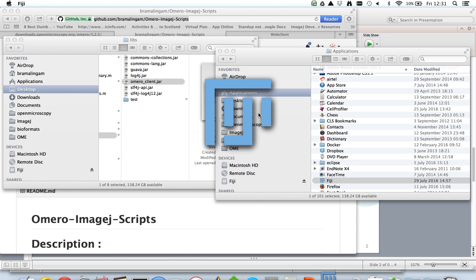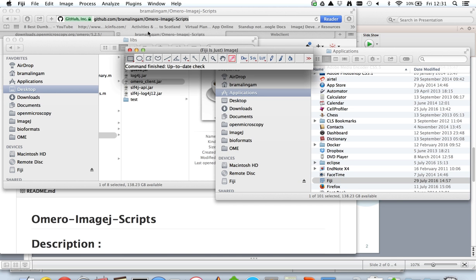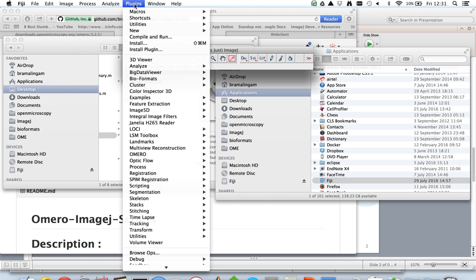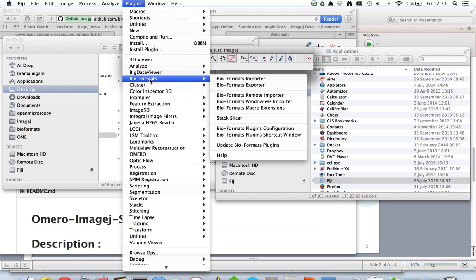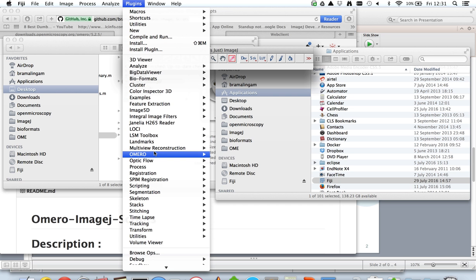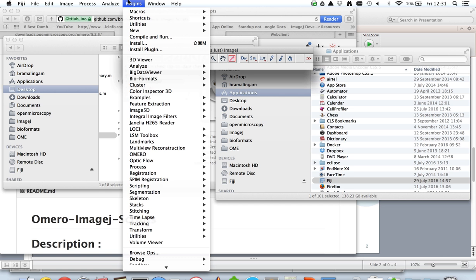Opening up Fiji now. If the installation has gone well, then you'll see the Bio-Formats and the OMERO menus under the plugins section within Fiji.